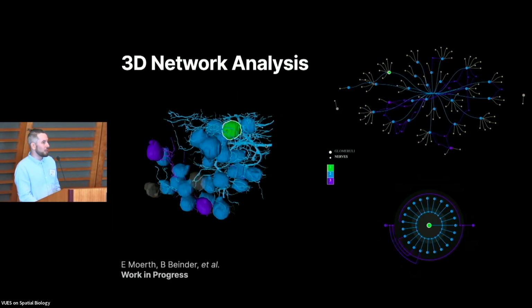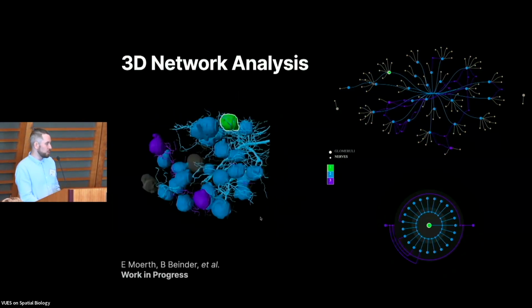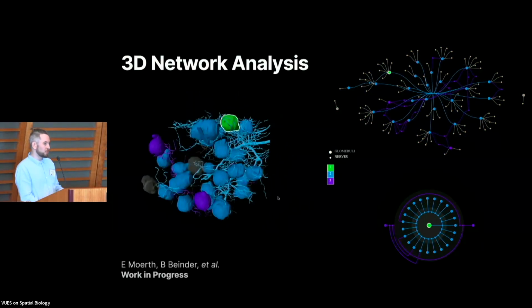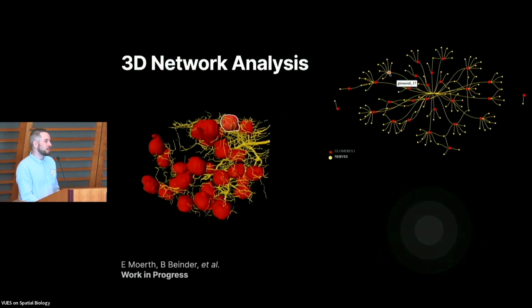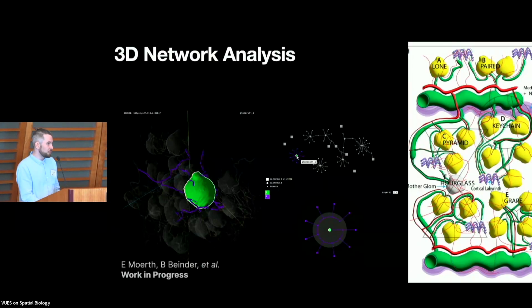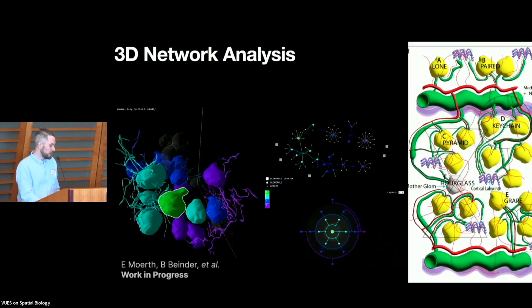So you can see who my neighbors are, by which nerves I am connected to those neighbors, and which neighbors I can only reach by talking to my direct neighbor. And so this can then really help to, for example, find all those motifs that Sanjay presented. I picked this from their paper, and we can see some of the motifs are quite easily spottable in our tool, like the lone glom, having no other glomeruli connected to it. Then, for example, a little more complicated, the hourglass.